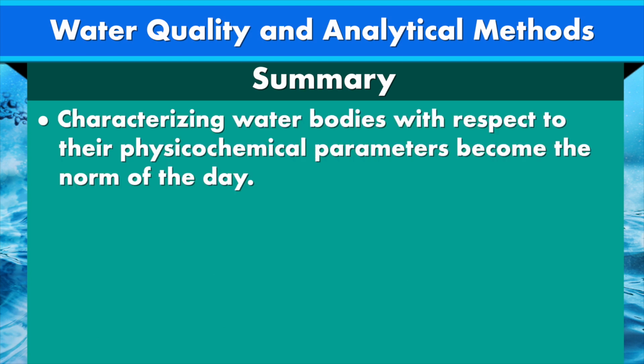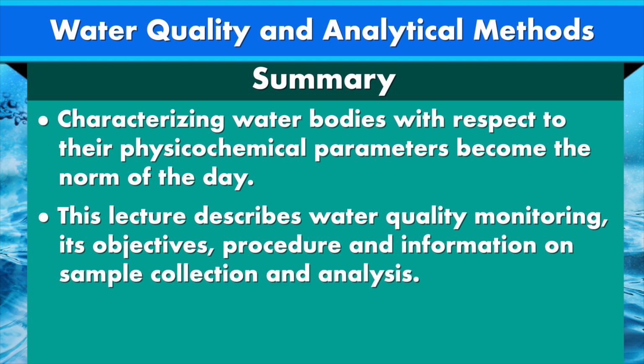Characterizing water resources for these physicochemical parameters has become the norm of the day. Therefore, this lecture describes some basic requirements, procedures and information on sample collection and analysis.